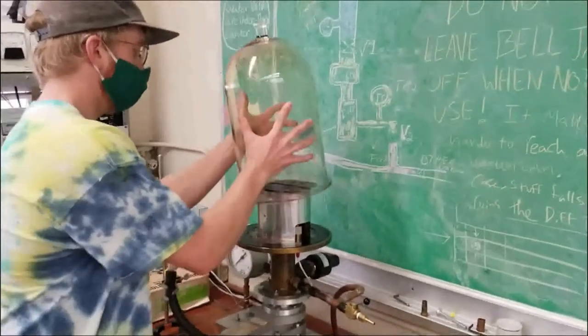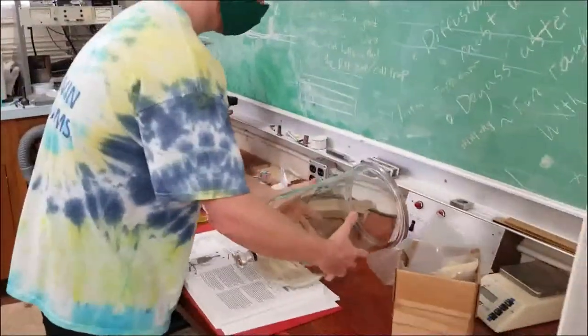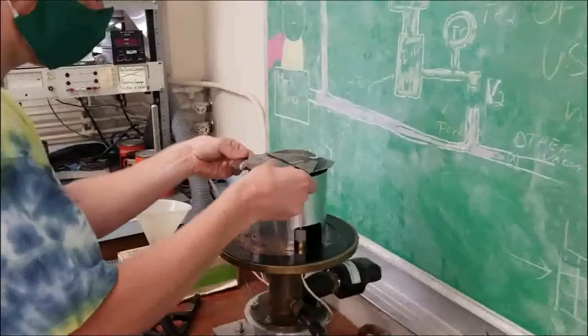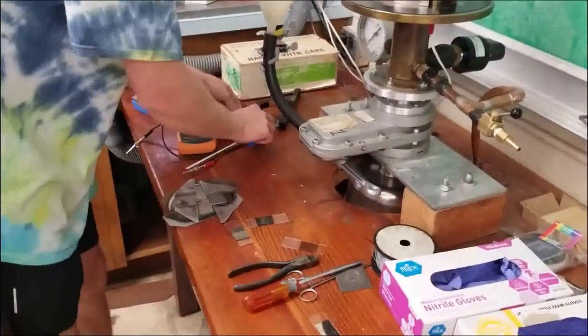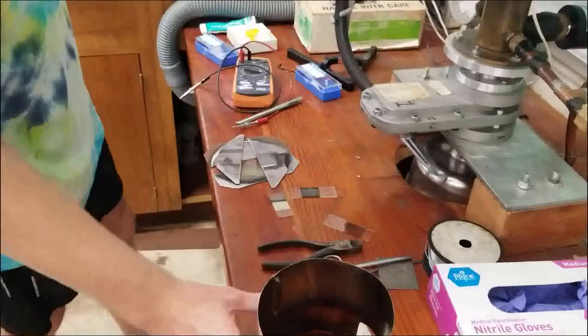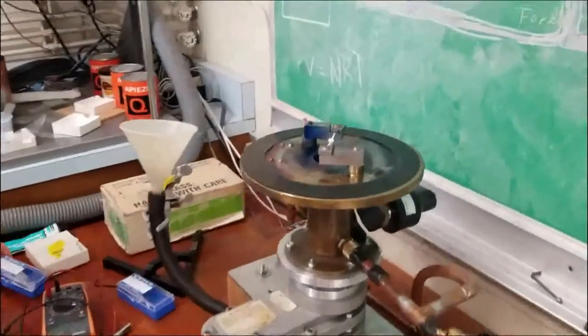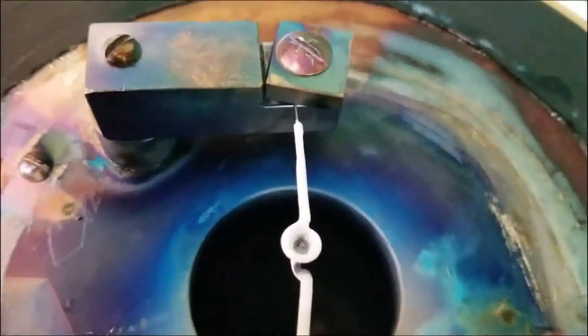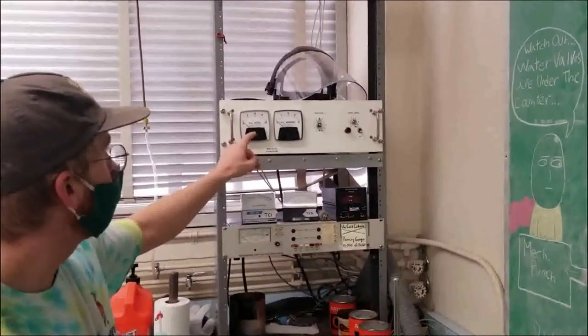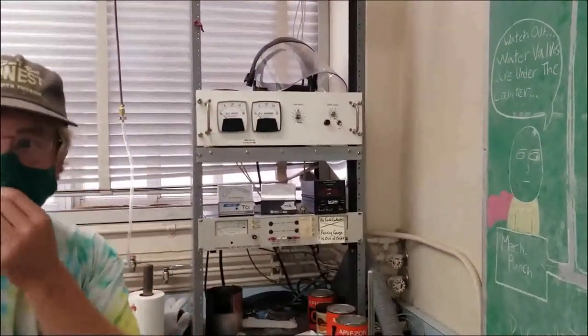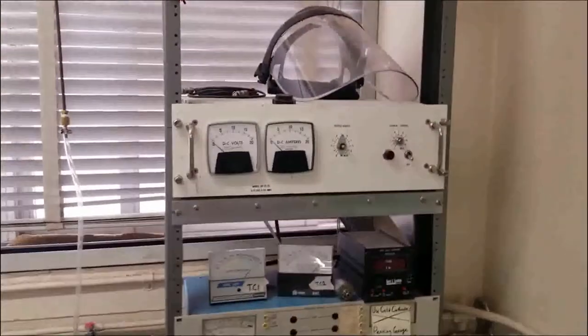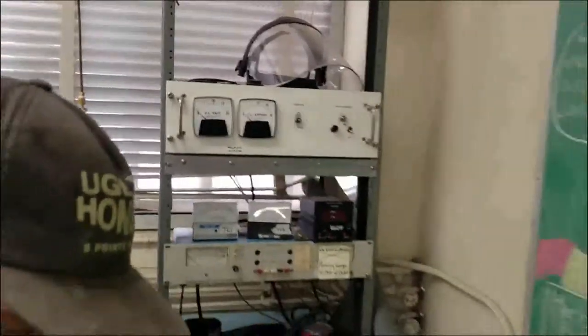The first thing we're going to do is set up the filament so we can do the deposition here. So it looks like someone smacked the slide around a little bit. There's a blank slide on there because someone was planning on using it and didn't end up. This guy inside here is a 60 watt filament. So that just means on here you don't turn it above 60 watts. The current times the voltage has to be less than 60 watts, otherwise it will just burn and we'll have to replace it. But I think these are like $20 to $50 so it's not super crazy if they replace it.